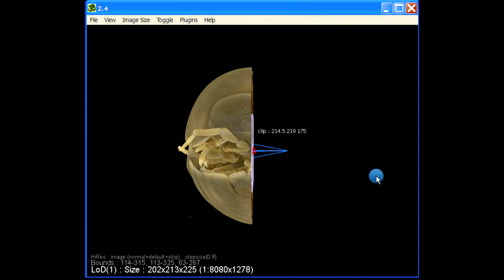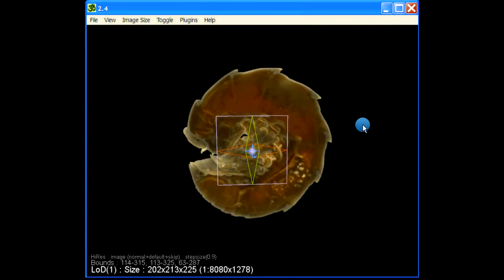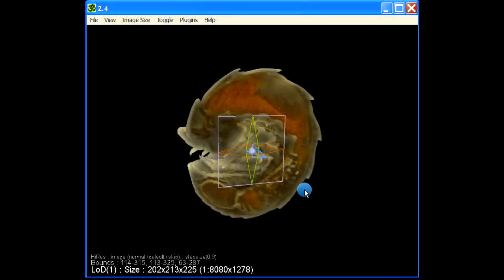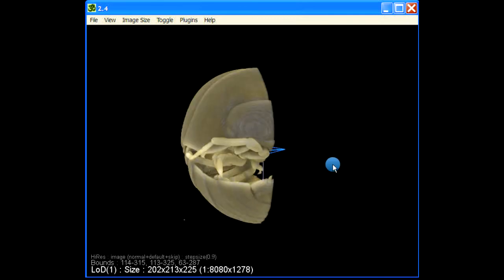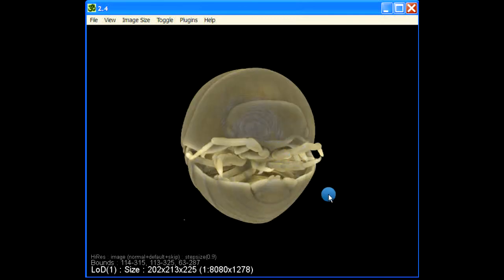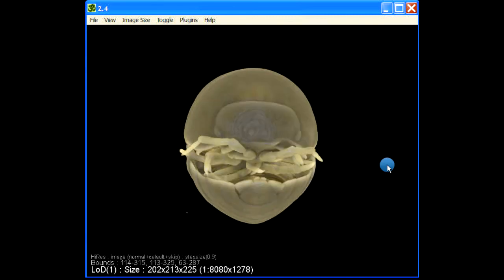So that way you can get a much more natural orientation. In other videos we will see how to use clipping plane for reslicing only a certain small region in your volume, and similarly using paths and reslicing to save the straightened volume.